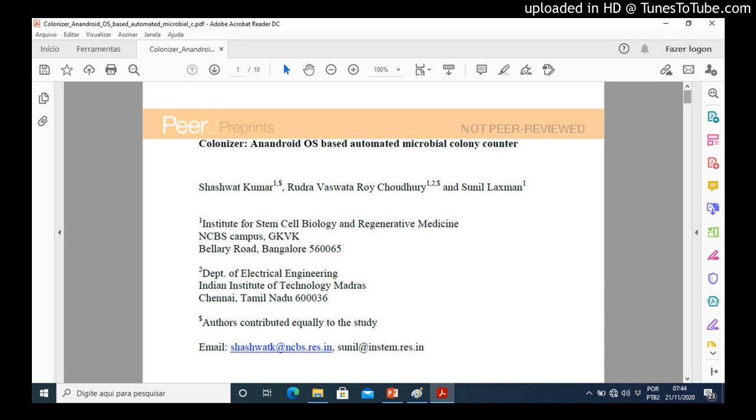Shang et al. in 2009 designed an automatic bacterial colony counting system using a Nikon D50 DSLR for image acquisition and an Intel Core 2 Duo PC for running the watershed algorithm for segmenting colonies. Recently, Brugger et al. in 2012 came up with a hardware setup for automatic counting of bacterial CFUs on agar plates.